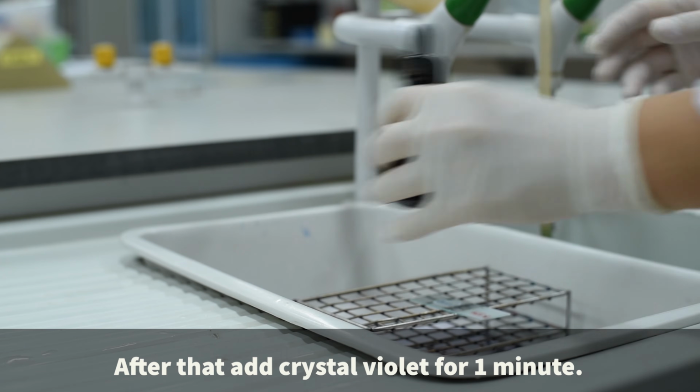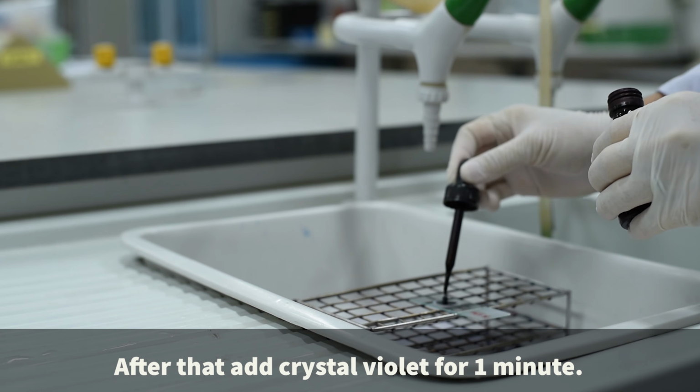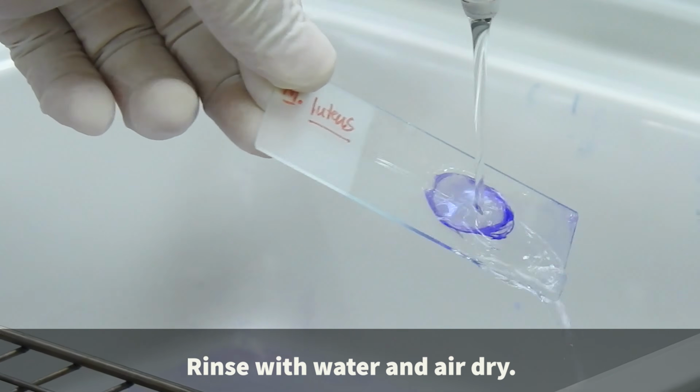After that, add crystal violet for 1 minute. Rinse with water and air dry.